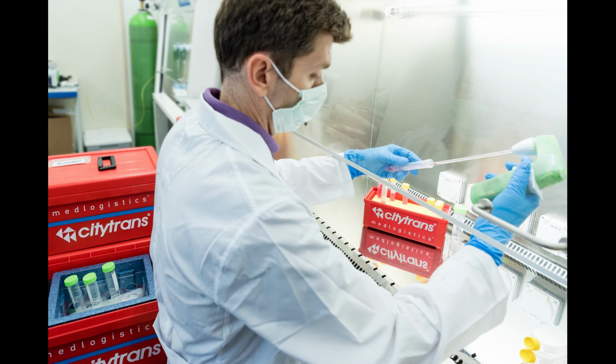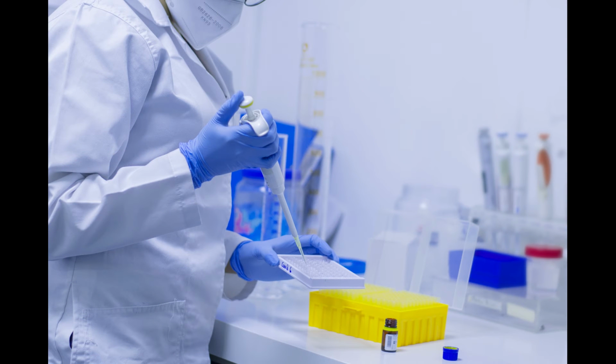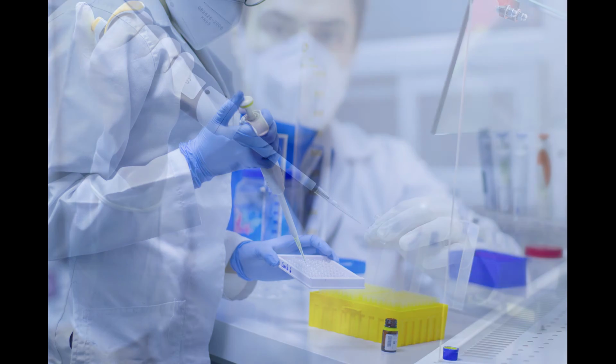You're still required to have all of your standard PPE, and you may even need to be wearing a respirator the entire time you're working within the laboratory. You also still need to continue with the appropriate biosafety cabinets. What changes is that rather than just having a sink, you must have a hands-free sink and eye wash facility that are available near the exits of the laboratory.